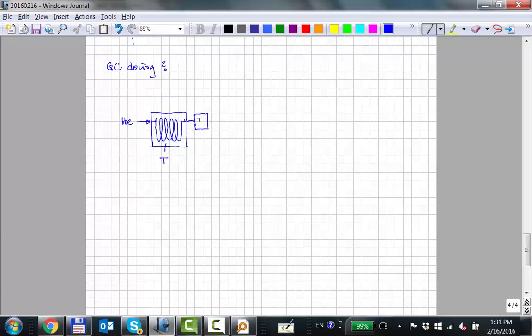God knows what it's doing, but it's detecting something, and it doesn't react to helium. Of course this just goes, I don't know where, into the atmosphere or something. So the detector, as time goes by, will give a measure, a detection. If it detects something, it will look like this. So it's going to go along like this. Nothing's going on. It's just helium.